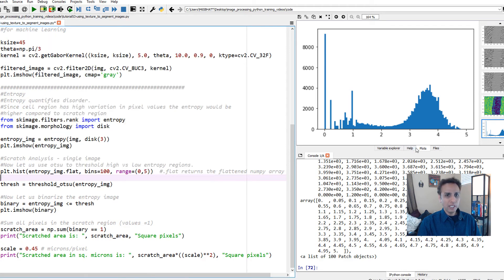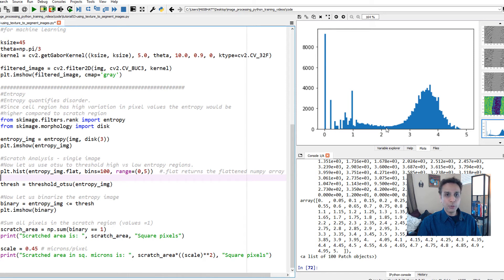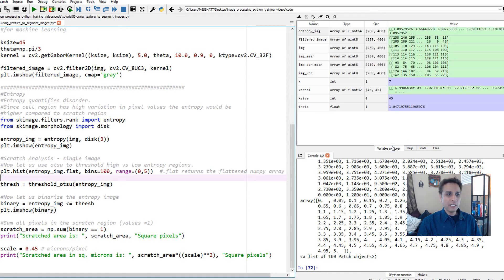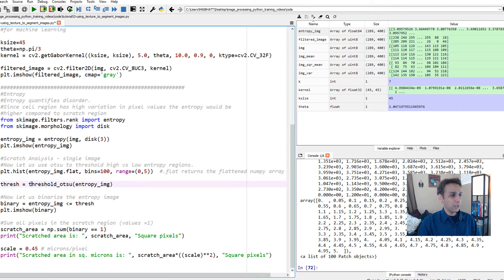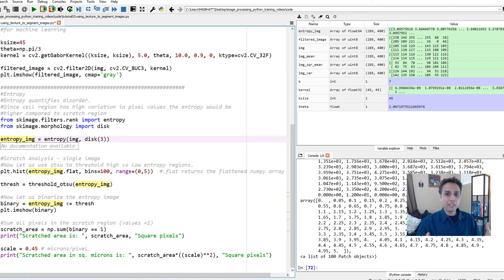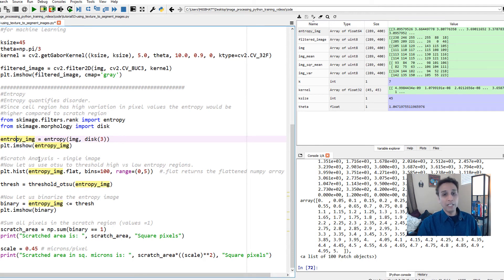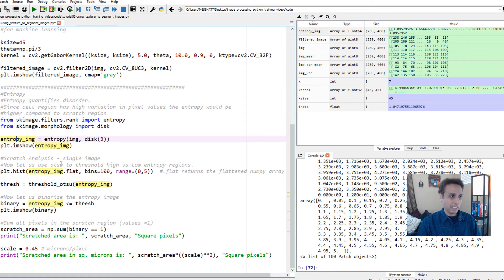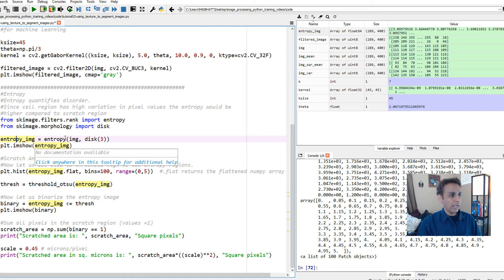I'm looking at range 0 to 5 because I looked at my variables for entropy. I looked at the maximum, it's 5. Let's plot a histogram. As you can see, these are all low entropy regions, these are high entropy regions. Let's try to separate them. It looks like it's around 2.2, 2.3 right around there.